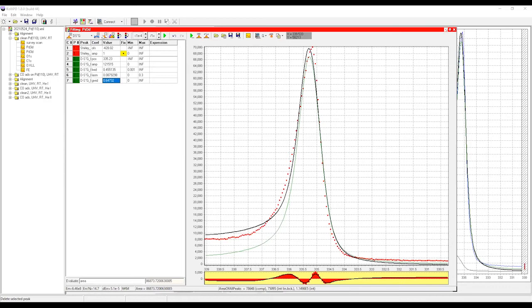As soon as you start to dose some gas at high pressure, you would always get a bit of carbon contamination, and this also happens in real life. You also have catalysts which work at ambient pressure. As soon as you increase the pressure and go to 300 degrees C on your catalyst surface, usually all these carbons are somehow burned by oxygen, and then you add another gas. They evaporate, they are volatile. But of course, at the beginning, when you measure the first step, the clean sample without gas, you always have this contamination because it's unavoidable. Okay.